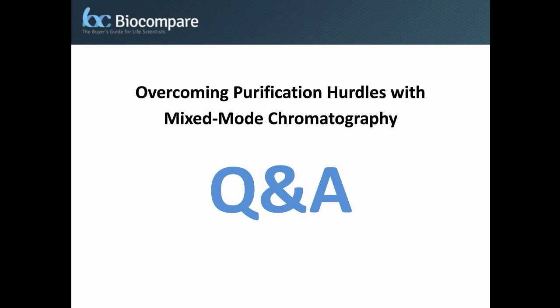Okay, great. I've got another question here: how can you decide what mixed mode resin to use among all the available mixed mode resins? Yeah, that's a great question, and the answer is really good news for process developers. It's going to keep you in business. The answer is, besides broadly separating them on the basis of charge, in other words, if you have a positively charged protein, you're going to want to pick a mixed mode ligand that has a negatively charged feature on it. Beyond that simple discrimination, there's no way to tell which one is going to work better than another one, so you just have to try all of them.